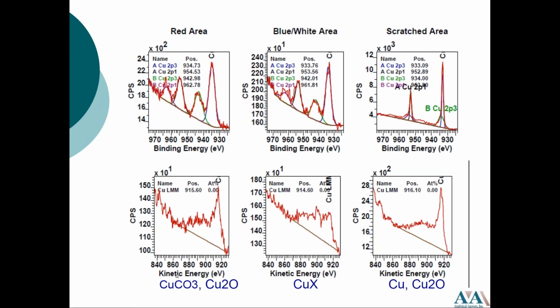This ESCA application has to deal with coatings. Quite often, substrates go through a surface treatment to modify the surface energy and increase these adhesion capabilities. On metals, it would be a chemical etch or mechanical abrasion to the surface, and on plastics, it would be a plasma treatment. So before we looked at a metallic sample, now we're going to look at an insulating sample.